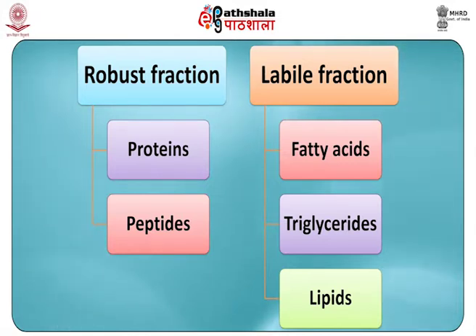Whereas the physical developer interacts with the robust fraction components of sweat residue, oil red O tags the labile fraction entities.